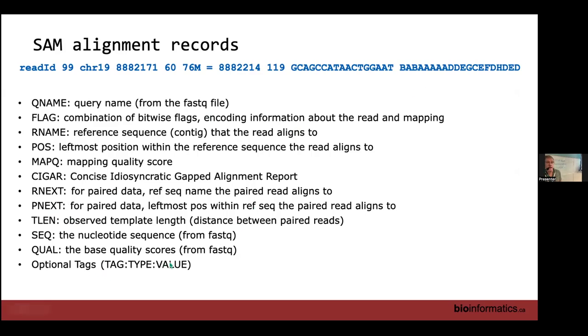There may be optional tags as well. I'm not going to get into that. You can read the SAM specification. Different software will use them in different ways to indicate additional information that's not encoded into this information here.